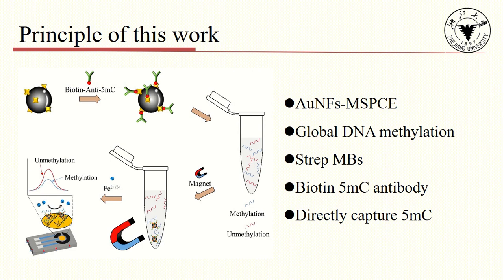However, previous assays have some shortcomings, such as being unable to distinguish 5-mC and 5-hmC, and incomplete conversion of other cytosine. Therefore, there is a great demand for bisulfite-free methylation detection.